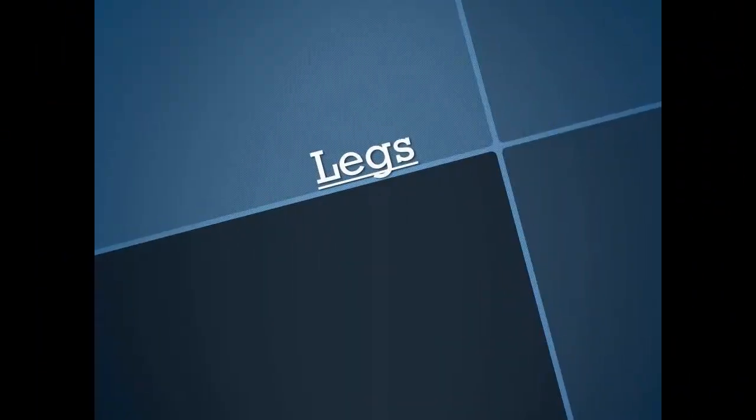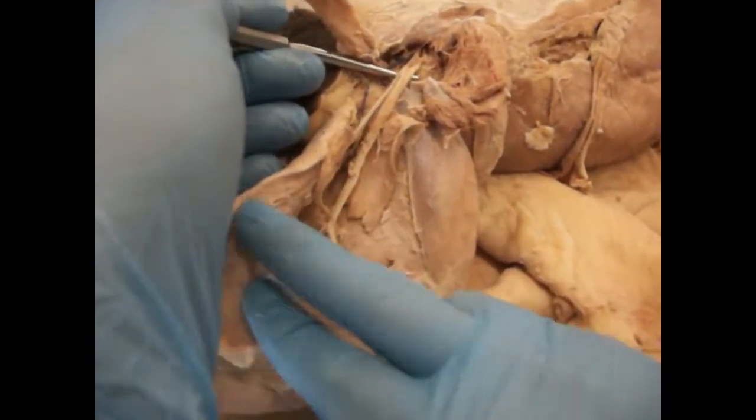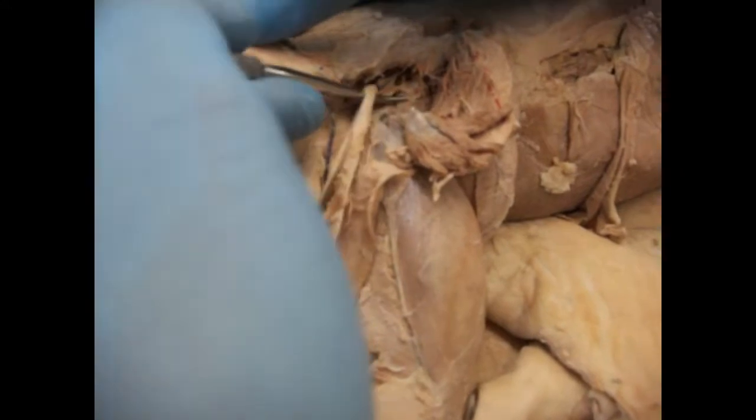Okay, now let's go over the nerves of the legs. Here is the posterior view of the cat once again. And this fairly large nerve is known as the sciatic nerve. It runs down from the spine down to the legs.